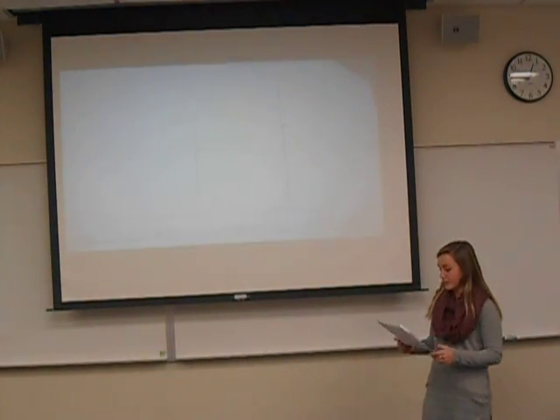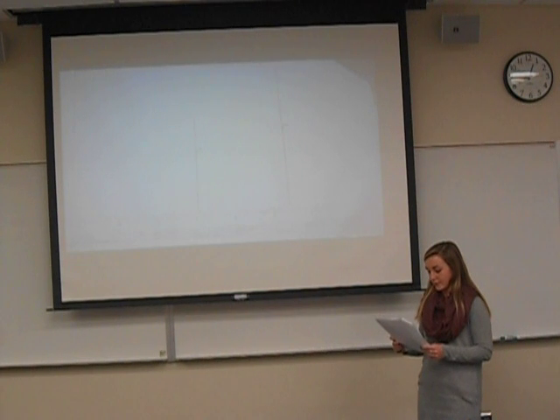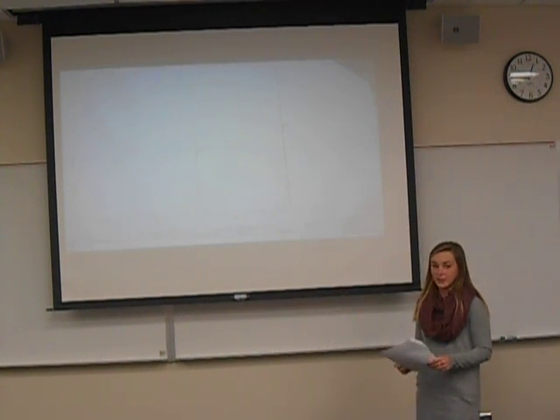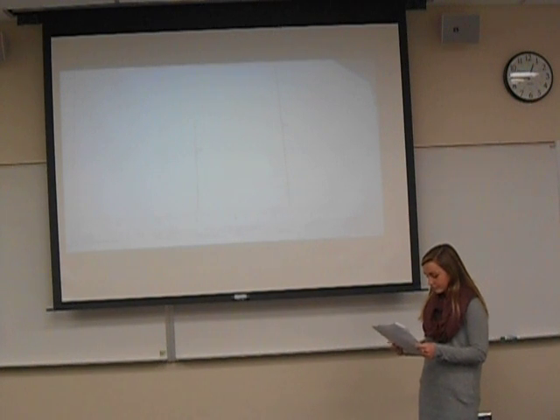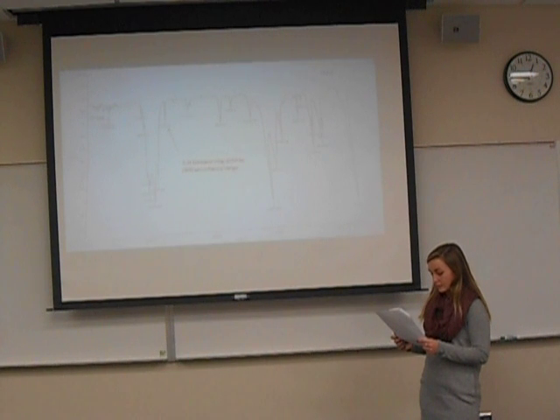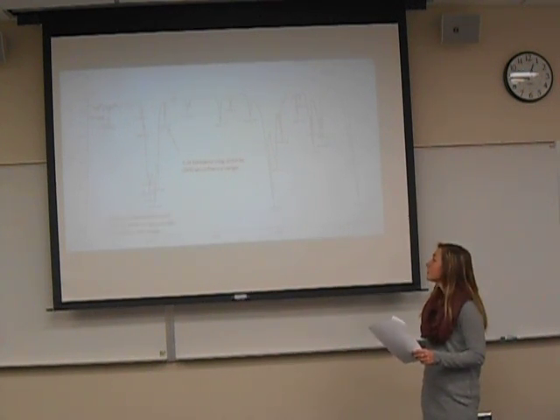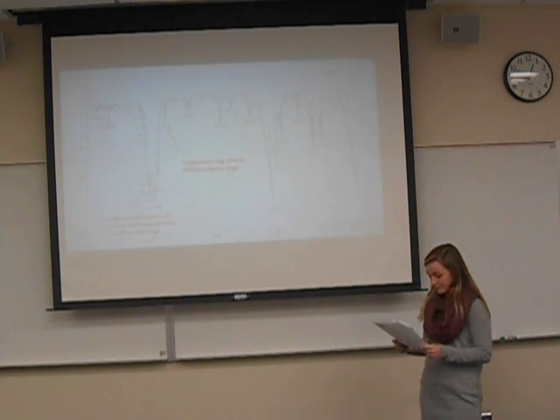For example, this is an NMR graph for molecule F. It shows 2 peaks, meaning there are 2 different types of hydrogens, and a 2:3 ratio, meaning there are 2 of one type of hydrogen and 3 of another type of hydrogen. The IR chart for molecule F shows peaks in the CH benzene ring absorbency range as well as the singly bonded CH range.